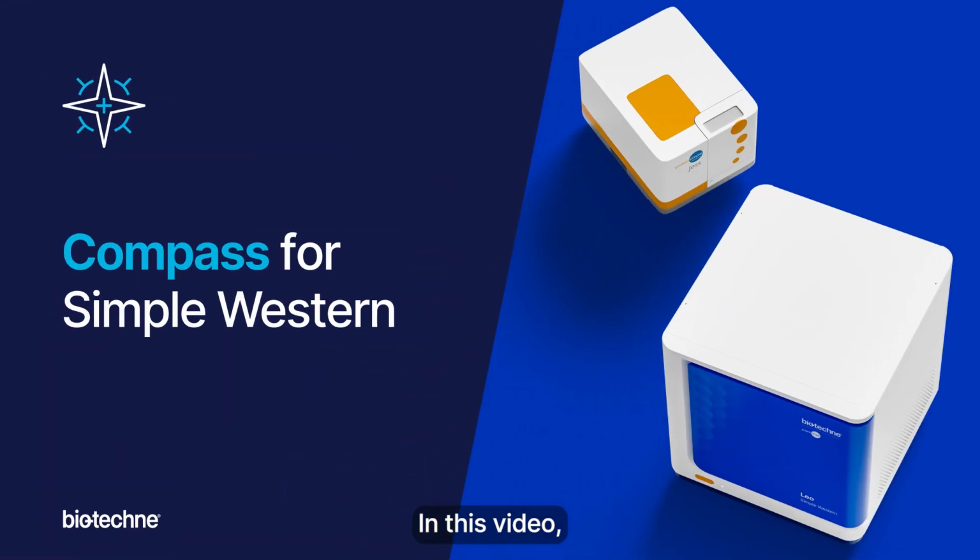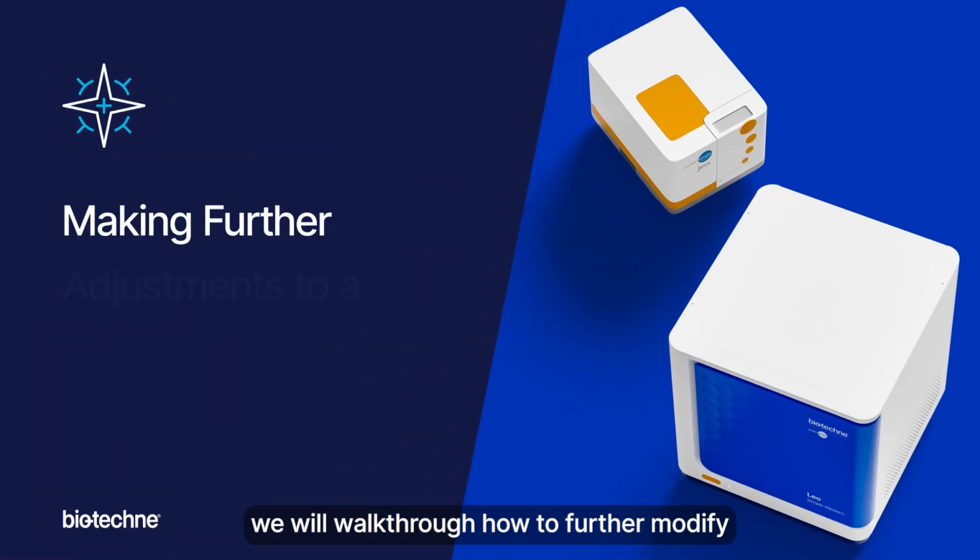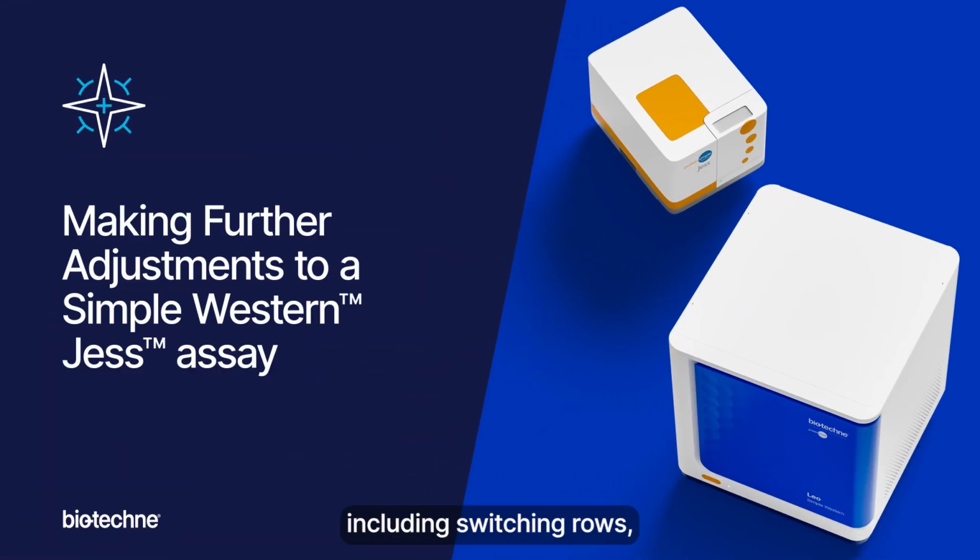In this video, we will walk through how to further modify default assay setups, including switching rows and adjusting the assay protocol to make Simple Western with Jess fit your needs. This can also be helpful when optimizing experiments.